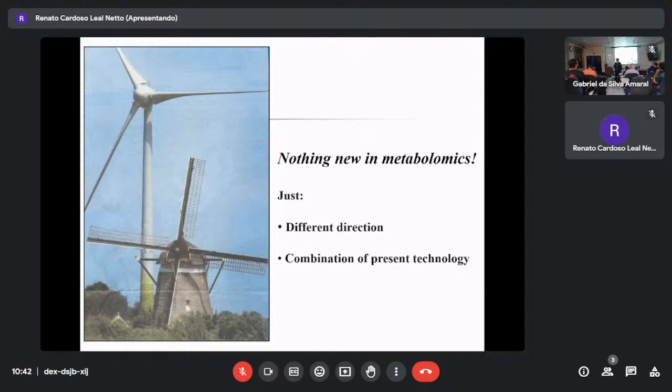That's why nowadays many instruments, particularly for mass spectrometry, when they have metabolomic data, select all the identified compounds and integrate them into known biosynthetic pathways. Biosynthetic pathways we already know in 100 steps: one step, second step, third step. Then you can imagine how they behave. In that context, you need phytochemistry.